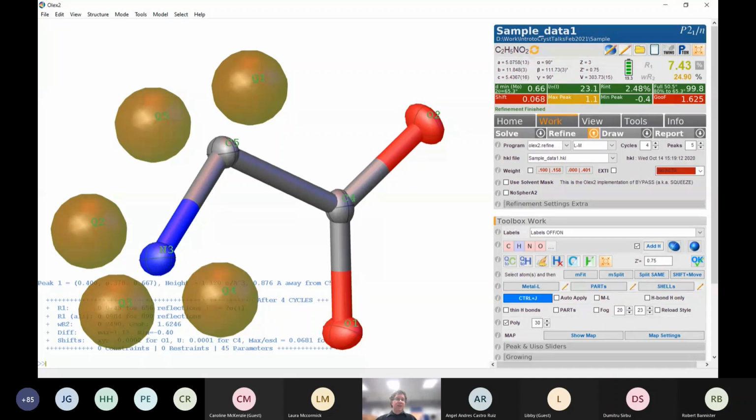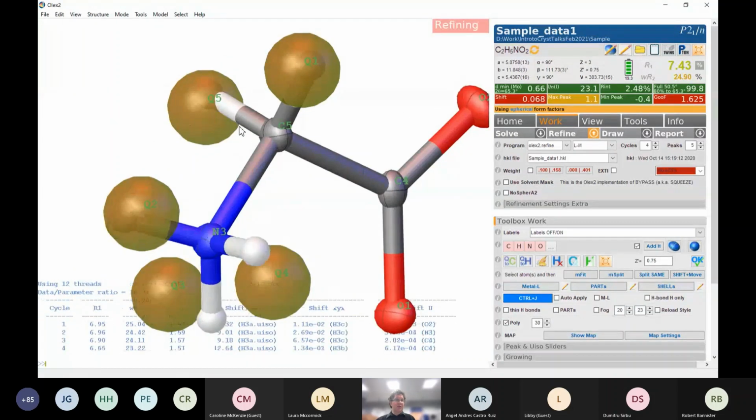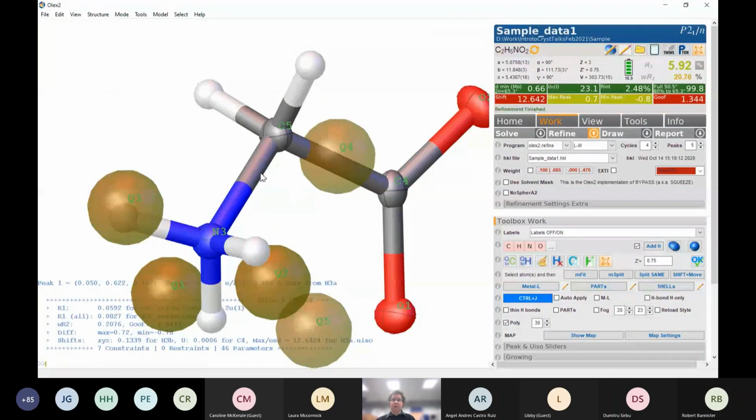If you're particularly involved in hydrogen bonding and you've got very good data, then you might want to put the hydrogens in by hand, and sometimes you might want to. But generally, most people will ask why you'd put them in by hand. They can be done like this all the time. The riding model is fine, as the accuracy with X-ray data is still not great. So we'll click add hydrogen, and it will throw in a whole load of hydrogens.